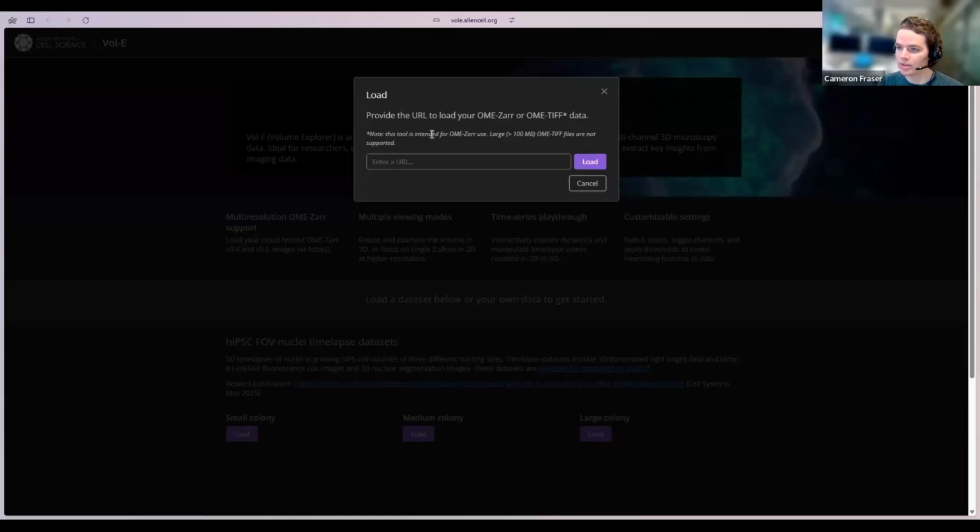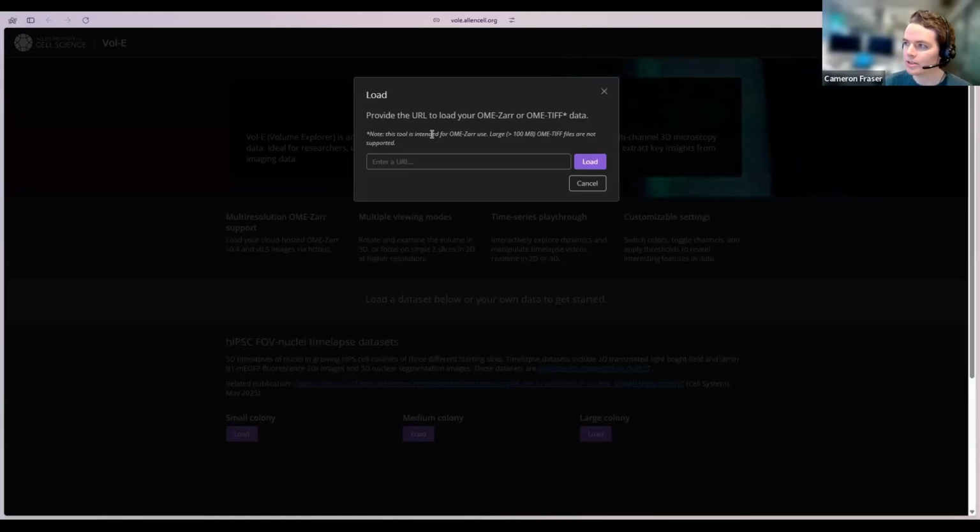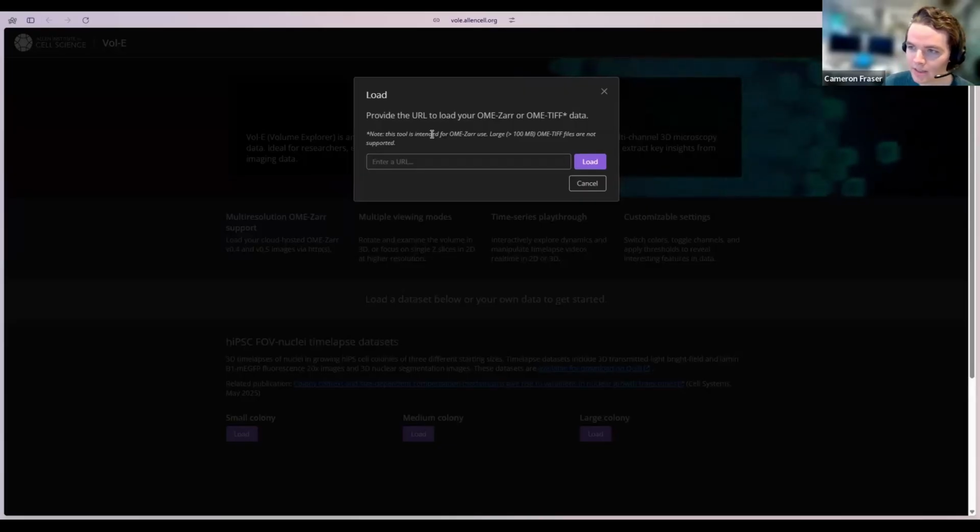And a Zarr can hold any old data. OME-Zarr is an open standard for how to give a Zarr the right structure and metadata to represent a microscope image specifically. So Zarr is the generic data container. OME-Zarr makes it specifically a microscope image.